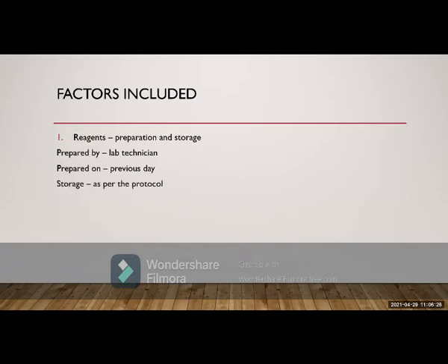How did you store it? That will be the third question. As per the protocol, what does the protocol say? Certain reagents need to be stored in refrigerated conditions. Certain reagents need to be stored at room temperature. Certain reagents should be stored in brown bottles, while others can be stored in transparent bottles. As per the guidelines given in the protocol, the storage was performed. This was the information we obtained from the people who did it. When you speak with them, this is what we have come across. This is the data we have regarding the factors in reagent preparation and storage.